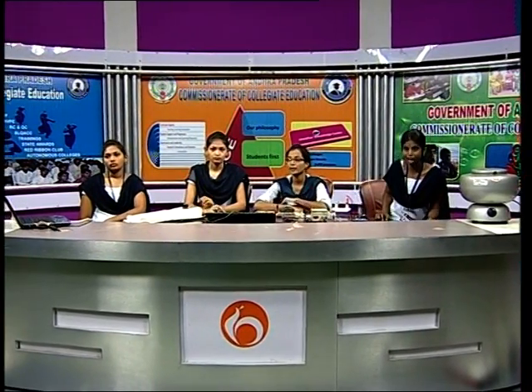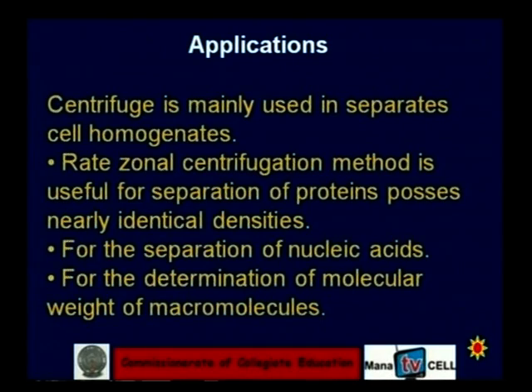The next one is applications. Dear friends, up to now we have discussed the principles and different methods of the centrifugation technique. It is mainly used to separate cell homogenates, and for cell count, how many WBCs and how many RBCs are present in our blood. Centrifugation is also used to estimate protein synthesis, and it is used for serum separation and also for blood tests.